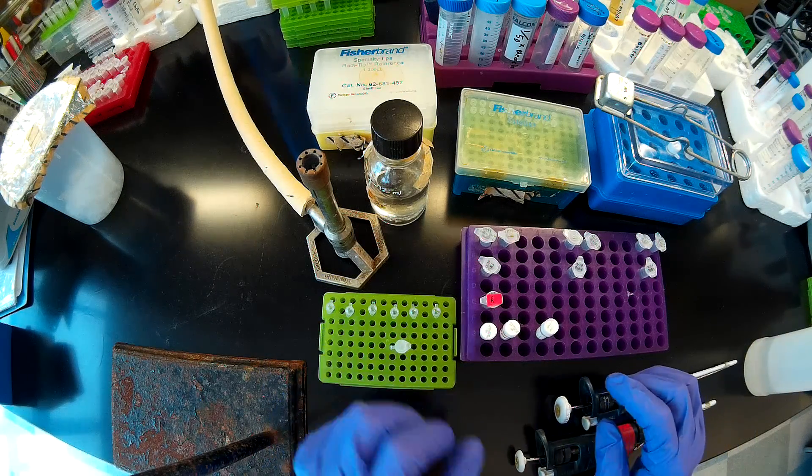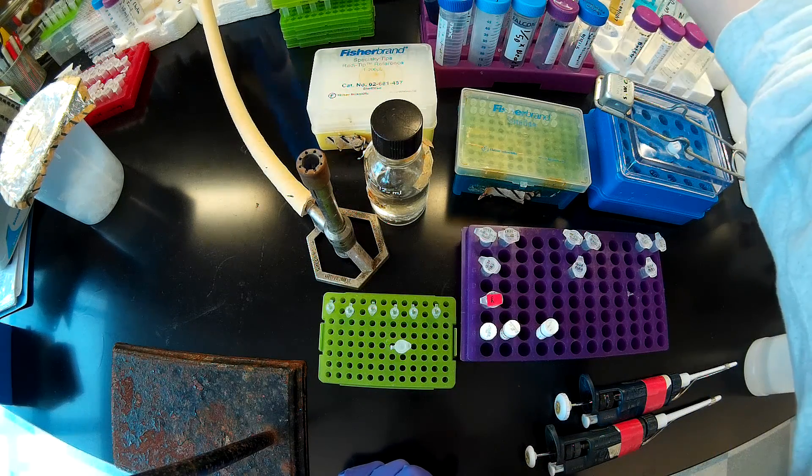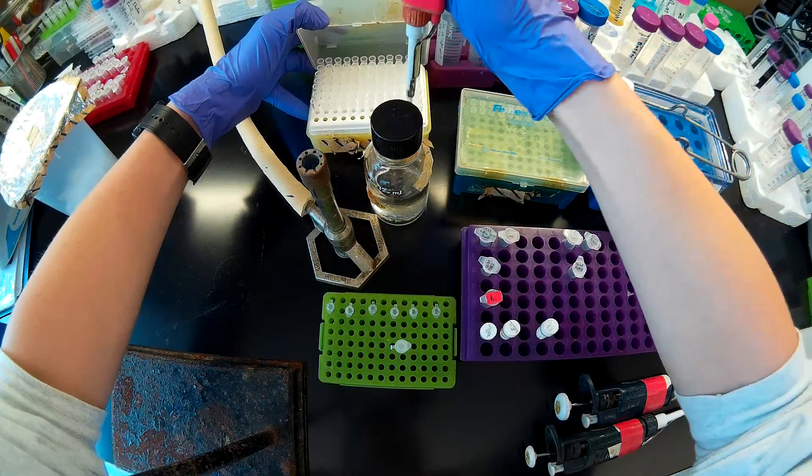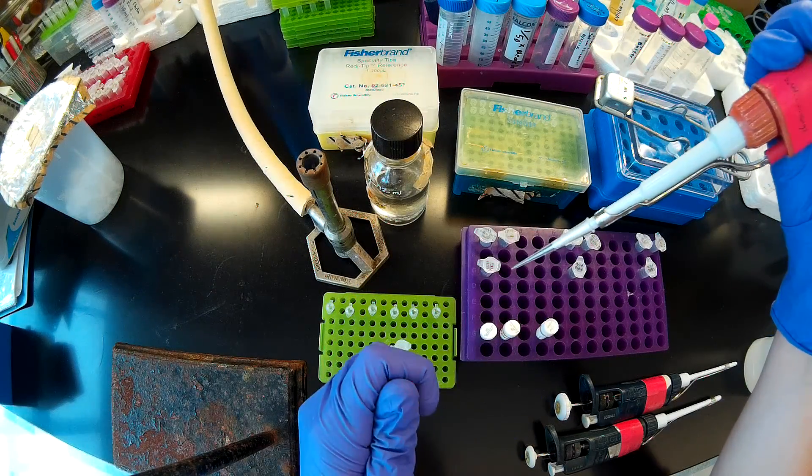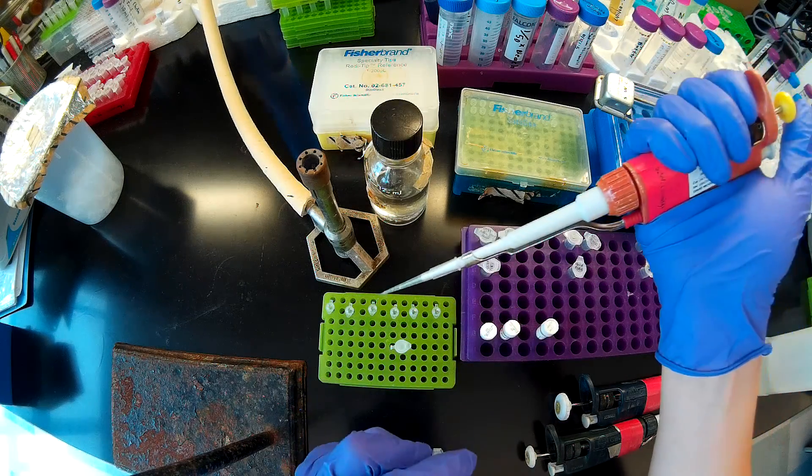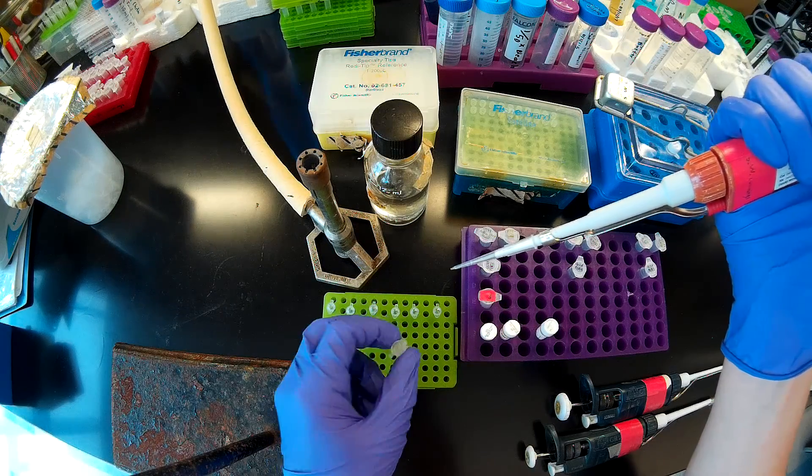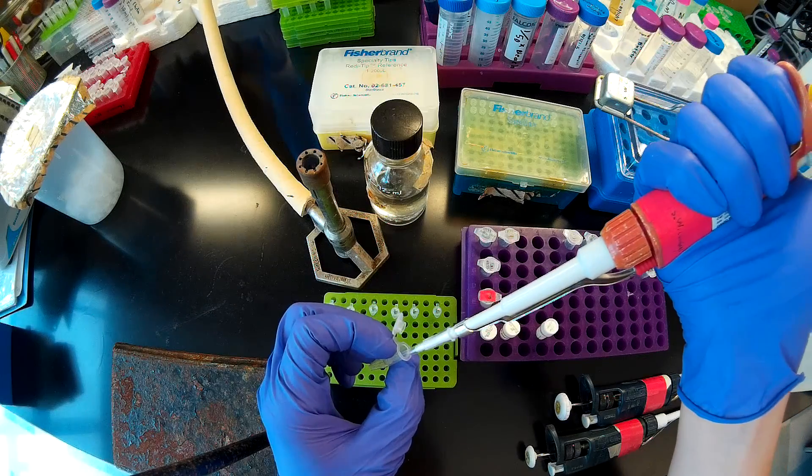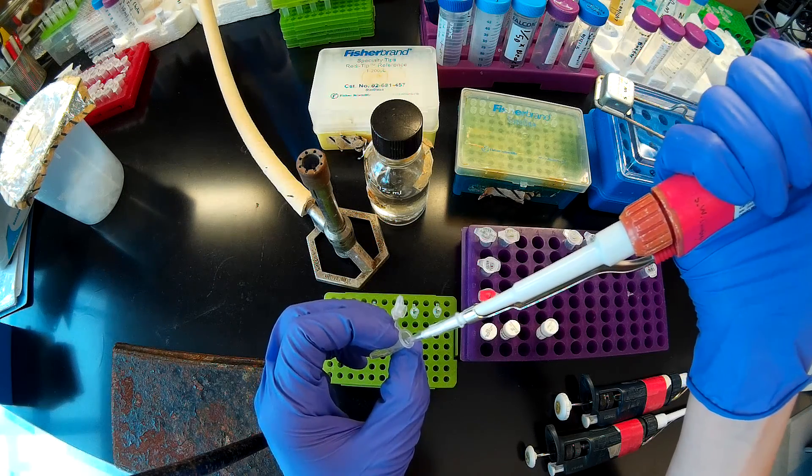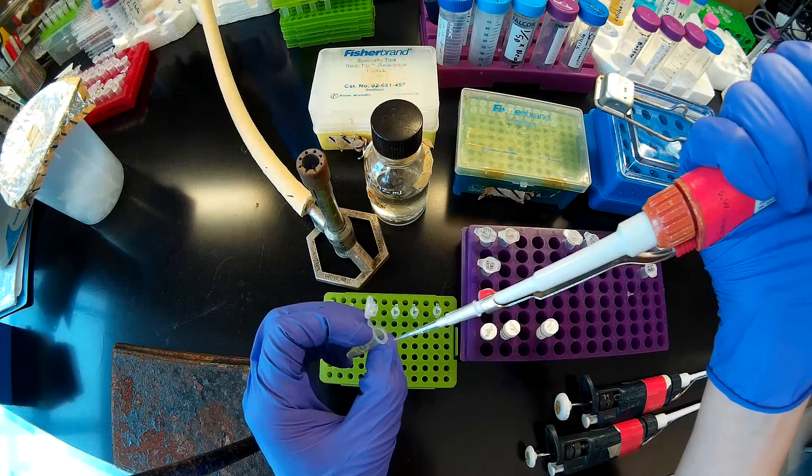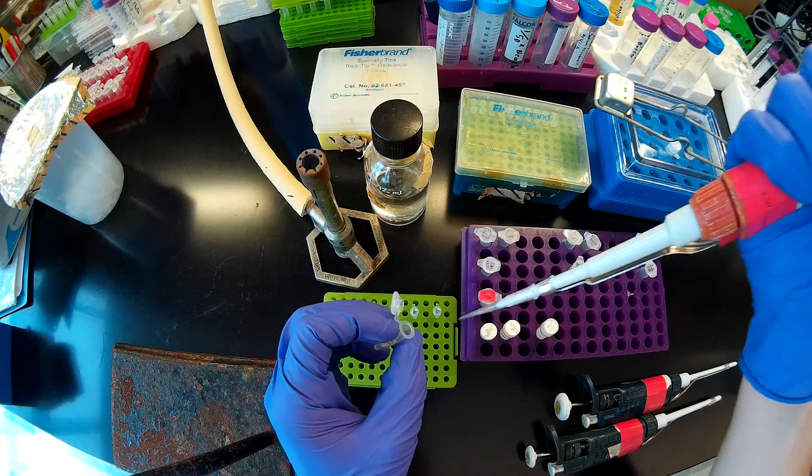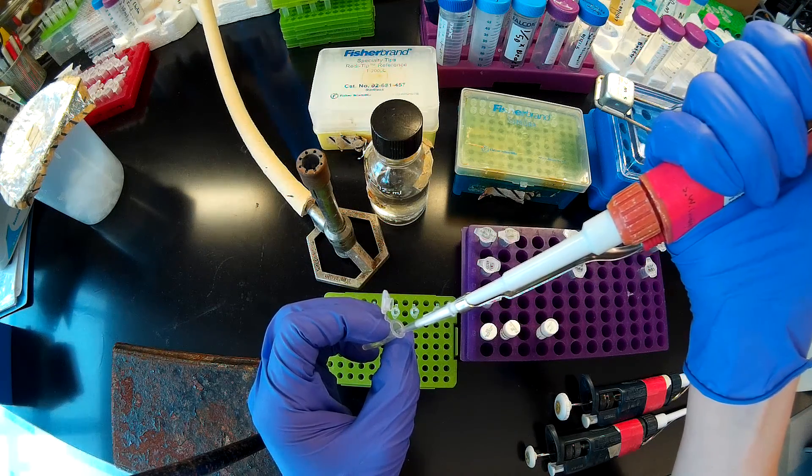After that, I'm going to add 15.5 microliters of my reverse primer, which I've had to cover here because it has proprietary information on the label. Pipetting up and down to mix at each step. There's a droplet of liquid in there that I would rather not remain behind. Got that down.